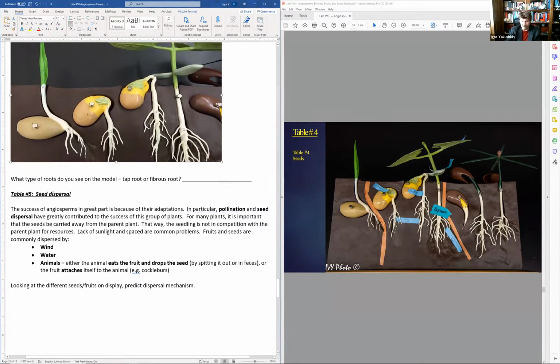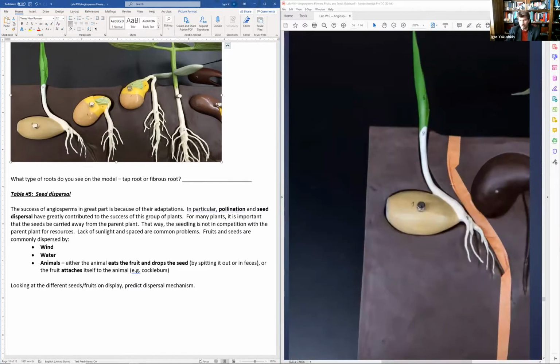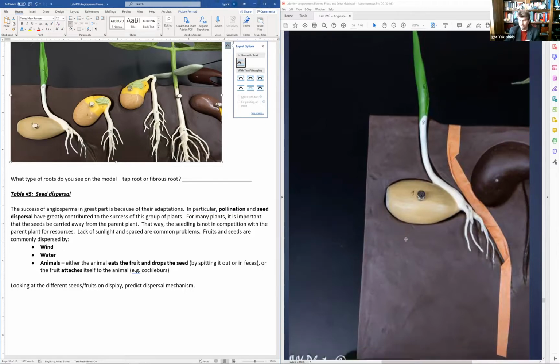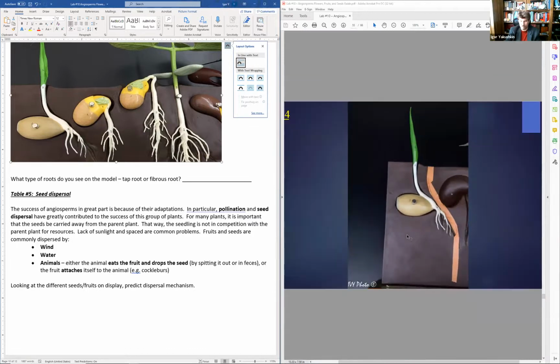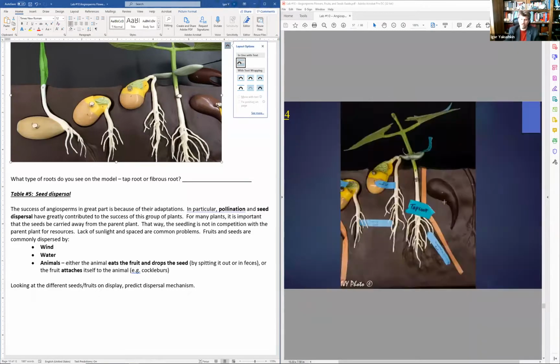All right, let's take a closer look at that one. So again, we're looking at the seed staying in the ground. The first thing coming out for the photosynthesis is the actual leaf, and the root system is relatively hard to identify, to tell which one is the main root. That's the monocot. And this is, I think, a dicot, a preserved dicot picture.